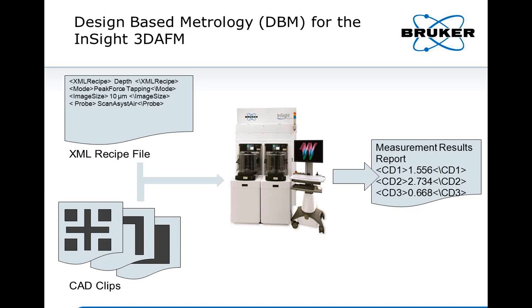Access to the chip design data and the CAD Clips is all great for design-based metrology, but all this data, and there can be a lot of it, must be compiled into a recipe that can be run on the AFM.